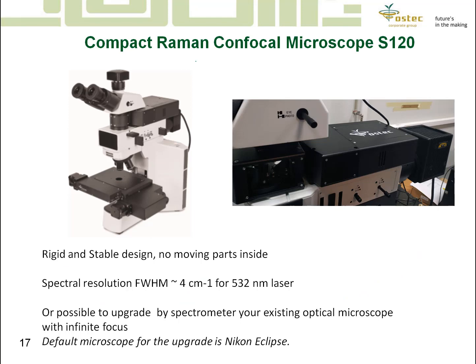So not only high-level research-grade microscopes can demonstrate such a high resolution, but also it's important for most of the microscopes.